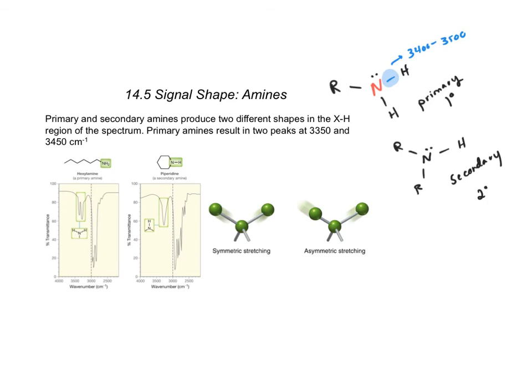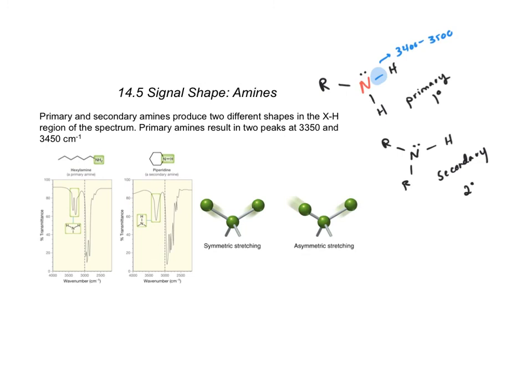That also depends on how many hydrogens are going to be there when we're looking at this group in the IR spectrum, okay? Now, whether we have a primary or secondary amine determines how many actual signals we see for the nitrogen-hydrogen bond, okay? If we have a primary amine where we have 2 hydrogens, what we're actually going to see is 2 separate peaks in our IR spectrum for that nitrogen-hydrogen bond, okay? You may think this is due to the 2 different bonds, right? It's actually not, though, right?